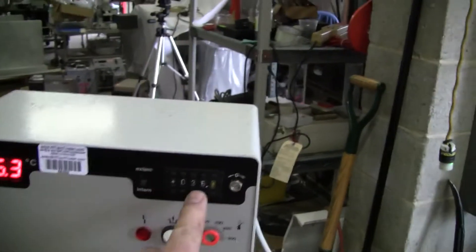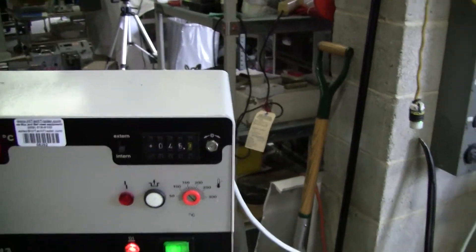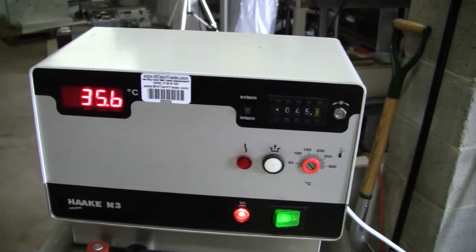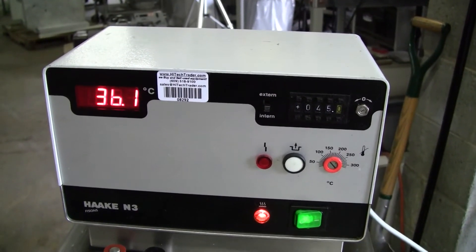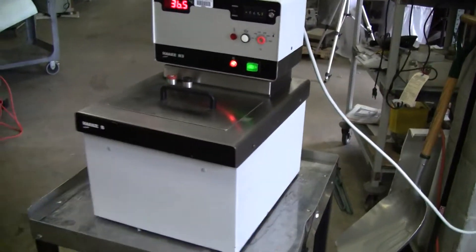Finding up the temperature a little bit. I'll put it up to 45 and you can see it rising. Okay, there you have it.